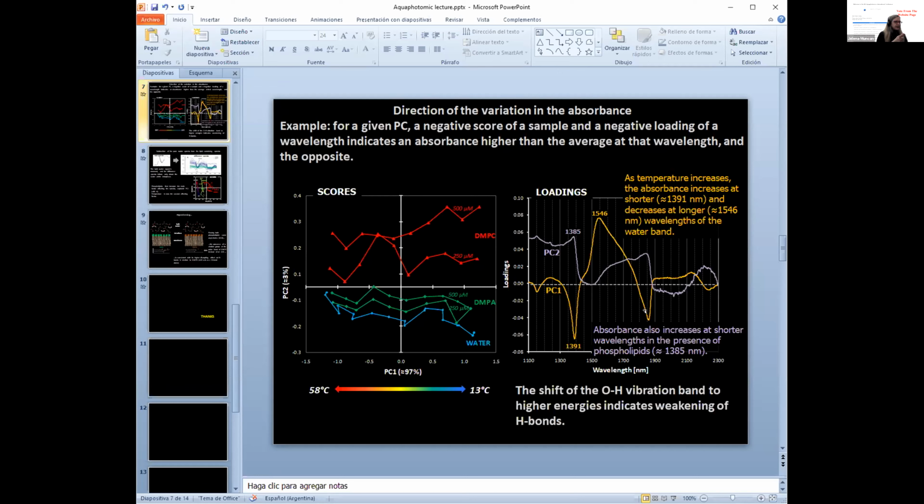And I think that around 1800, this is where you can see proton mobility, or basically fluidity of your system, water activity. Yeah. Interesting observation. I never saw it, so it would be nice if I can know the band around 1800. Okay. We discuss later.